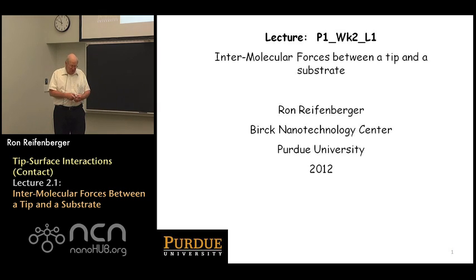And in week 2, what we intend to do is take the discussion that we had in week 1. We're going to take the fundamental result, which is the 1 over z to the 6th dependence of interaction potential energy between two molecules. We're now going to incorporate that and try to understand what the implications are for a tip interacting with a flat substrate. So we're moving more away from the physics and getting more into the fundamentals of atomic force now.